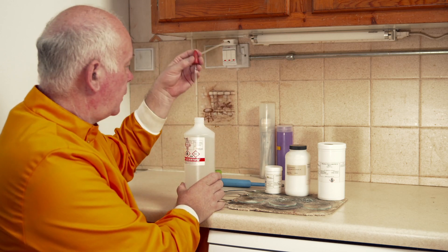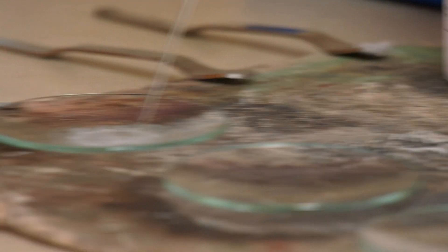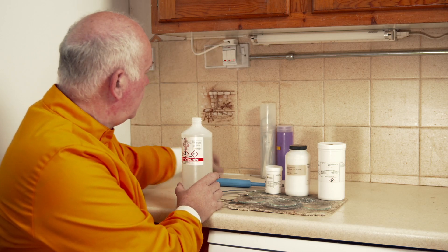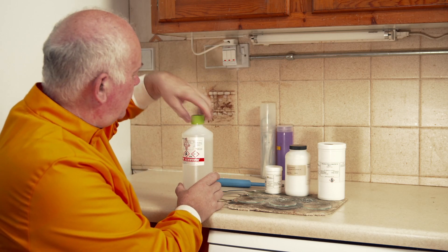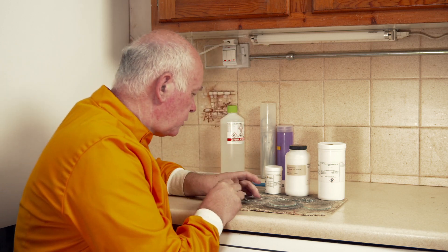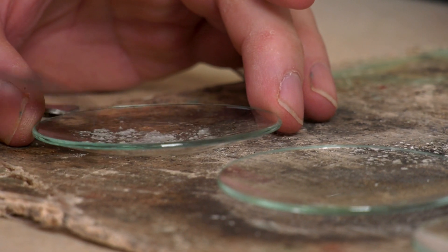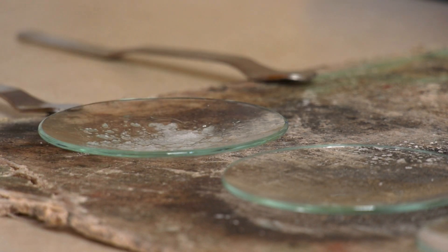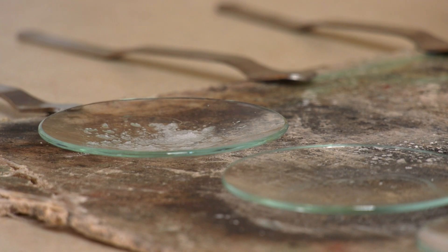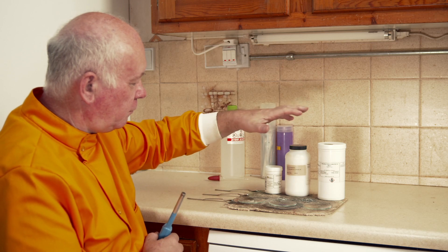Now, methanol burns with a clear flame which we can't really see. We've also got it mixed here with some lithium chloride. Let's look at the flame first — it's virtually invisible.